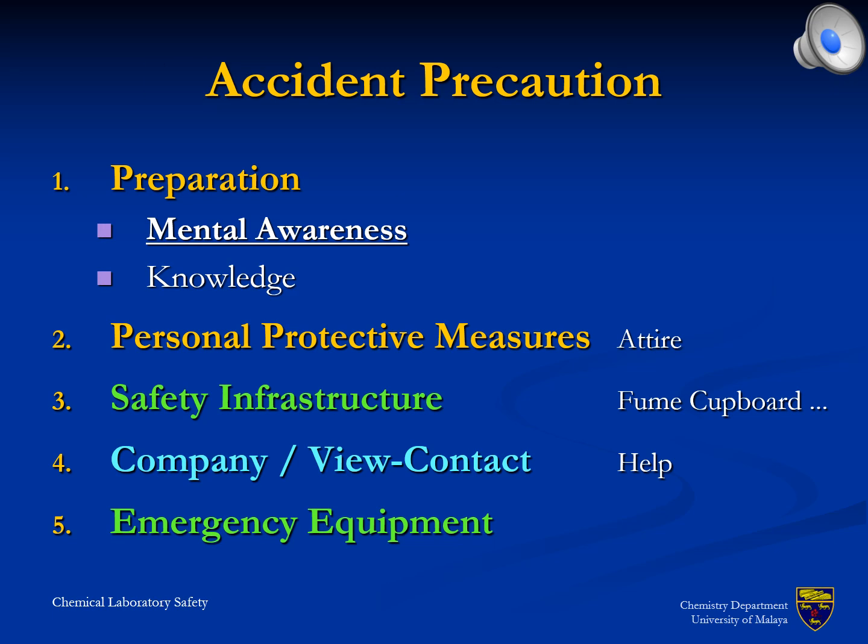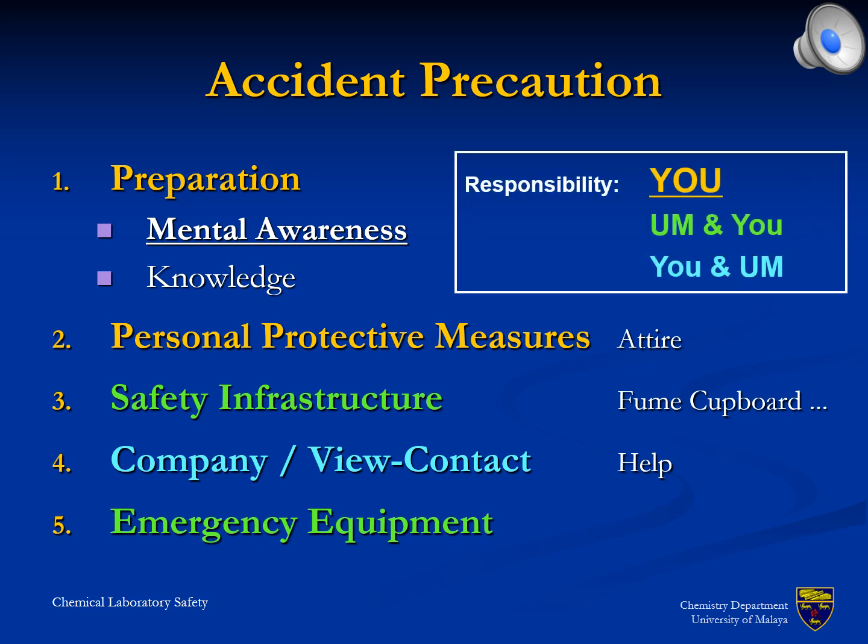Accident precaution covers several levels, which all depend on the person working in the chemical laboratory. Although the university takes responsibility for some of the action, it does not release everyone from sharing this responsibility.